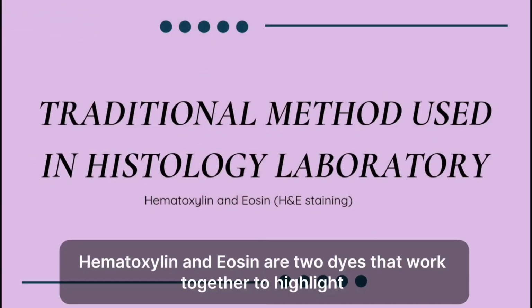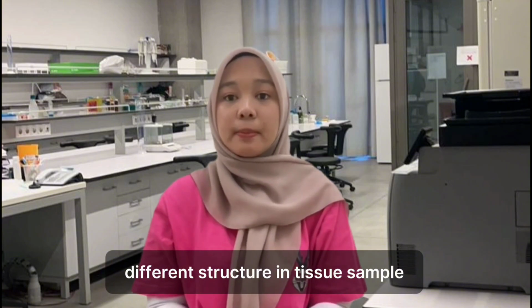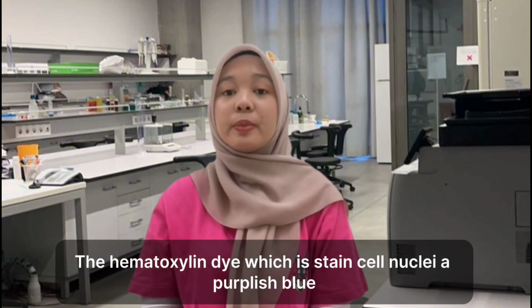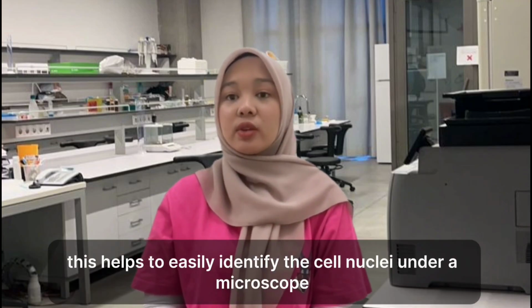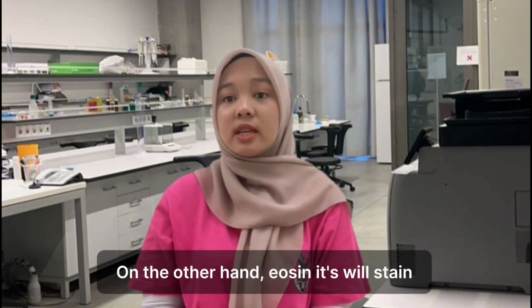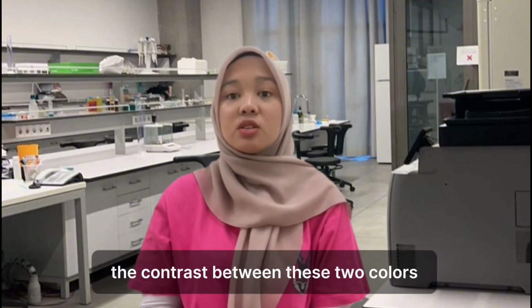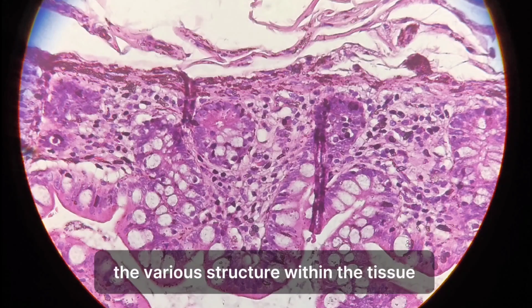Hematoxylin and eosin are two dyes that are used to highlight different structures in a tissue sample. The hematoxylin dye stains cell nuclei purplish blue. This helps to easily identify the cell nuclei under a microscope. On the other hand, eosin stains the extracellular matrix and cytoplasm pink. The contrast between these two colors makes it easier to differentiate the various structures within the tissue.